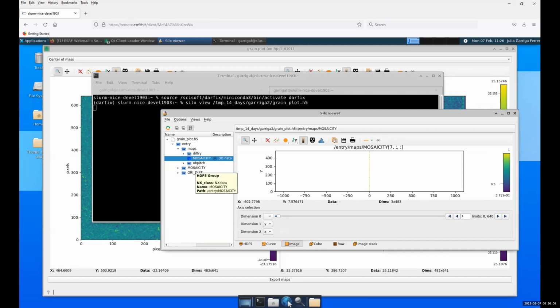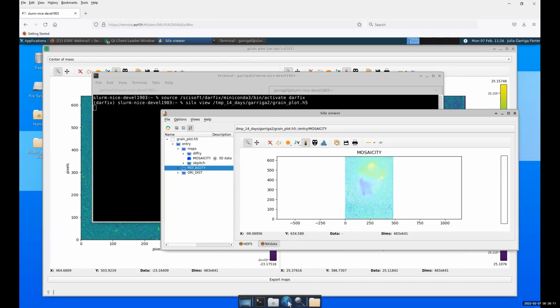Excuse me. Yes. I got it running, but I'm a little bit behind you. What were the dimensions to select? DFY and OB pitch. OBP.